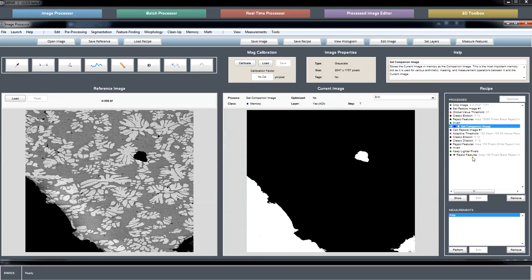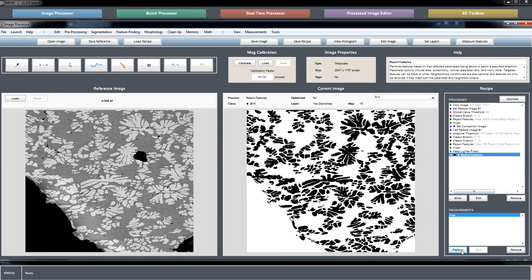So you know, you have 3.1 million pixels that you're considering, and 1.2 million of those belong to features, so 1.2 over 3.1 gives you your area fraction.